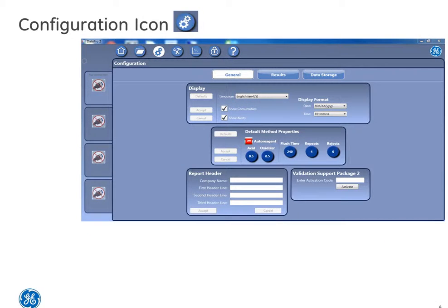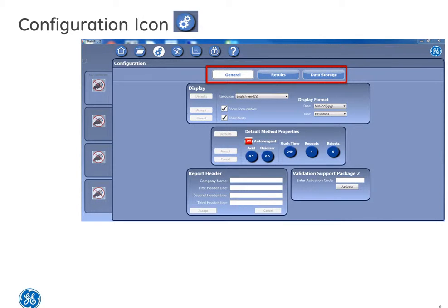Next, configuration and settings. You can see there are three tabs: general settings, results, and data storage.